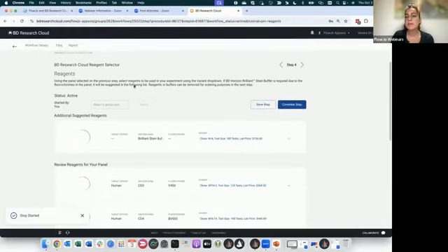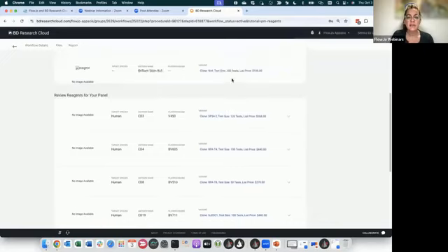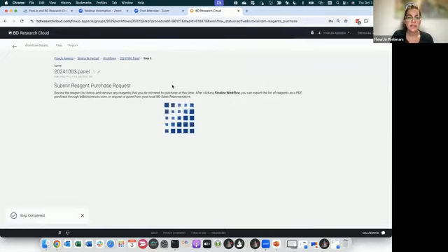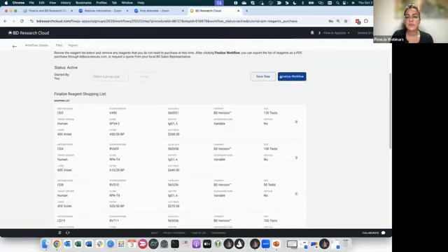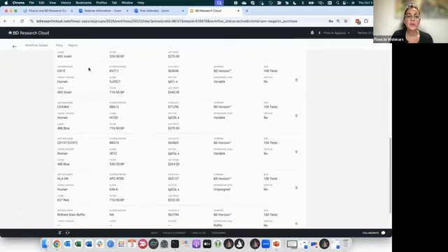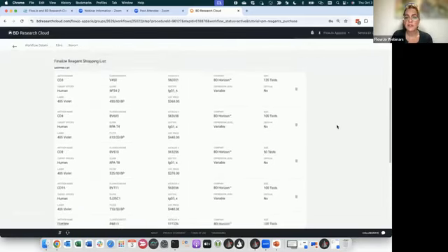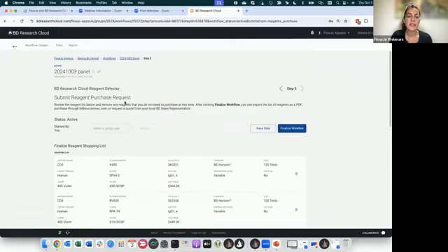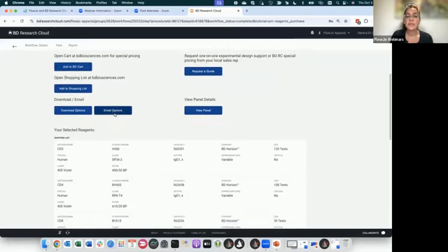Whenever I complete my step, it will eventually suggest that I add a brilliant buffer because I used brilliant reagents. And then I can complete this step as well. And then right here, I have the options to finalize my workflow or to save this step and come back later. You will have the information on all the different antigens and fluorochromes that you are using.